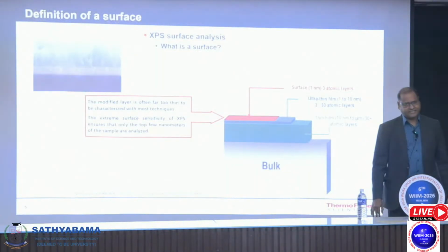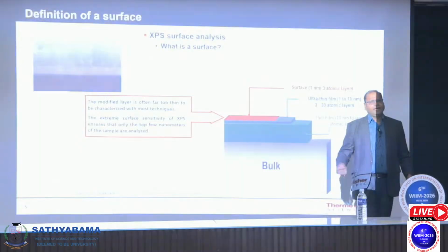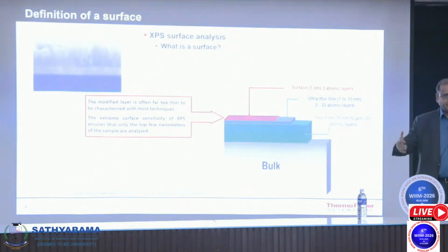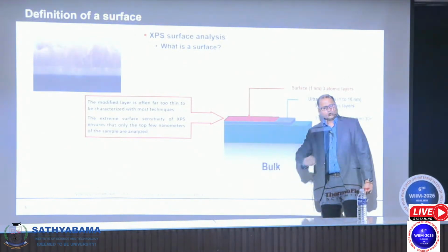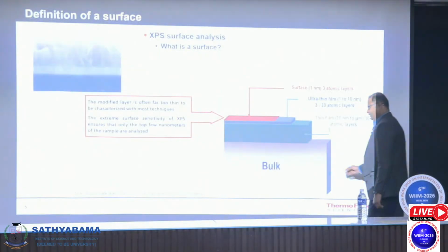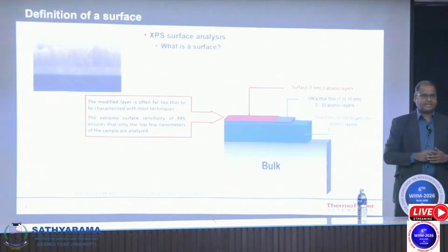Now, in terms of depth of characterization, what is the difference between XPS and other techniques? We just saw that XPS gives you information from the top 10 nanometers, whereas every other characterization technique that you use in the lab, either XRD, XRF, or an EDS attached to an SEM, helps you understand the composition. All these techniques give you information from the bulk of your sample, which is about a few tens to a few hundreds of microns. So if you want an overall understanding of your sample, both the surface and the bulk, characterizing using XRD, XRF and EDS, and also characterizing the top 10 nanometers using XPS, gives you an overall understanding of the sample.